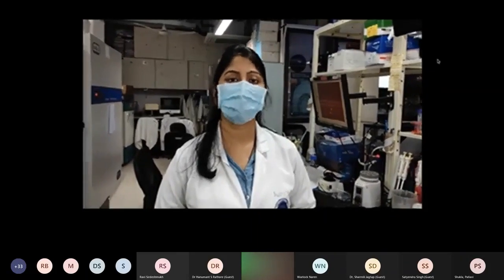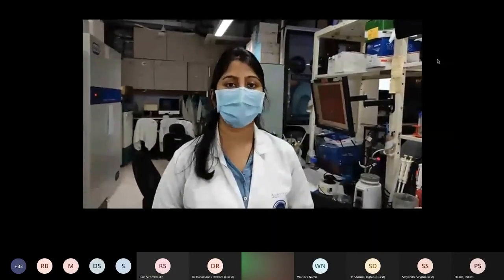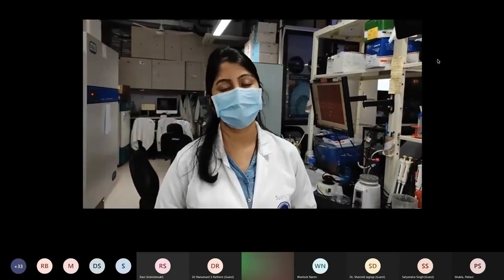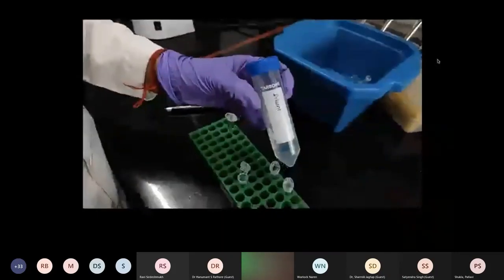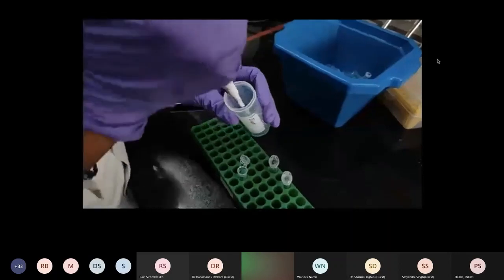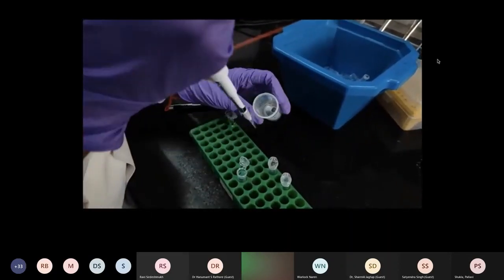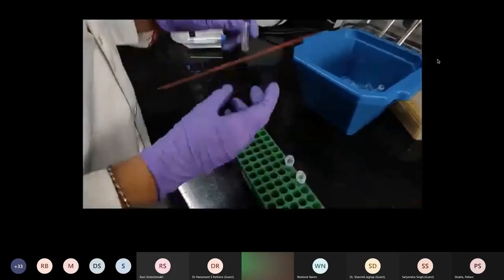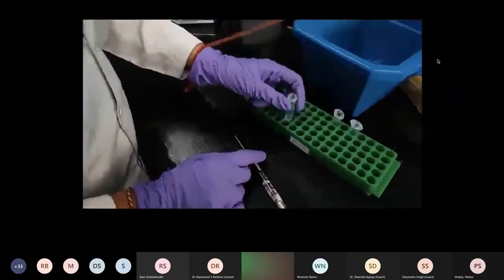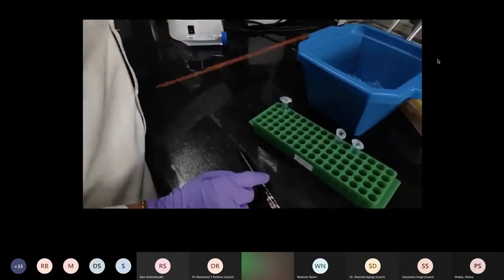Before that, the step is dilution, which means we first need to dilute the molarity of urea that was present in the initial sample. So the diluent is used for diluting the sample. An appropriate volume of diluent is added to the sample. Before addition of trypsin, make sure that the pH is 8 so that it can work properly.